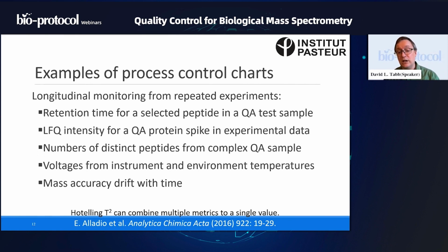That's very valuable if you're trying to do something like match between runs in MaxQuant. If you tried to switch columns in the middle of a MaxQuant style experiment, you would probably have big problems because the retention times would no longer match. It's an important factor to keep in mind.